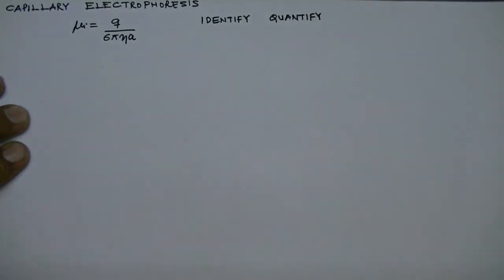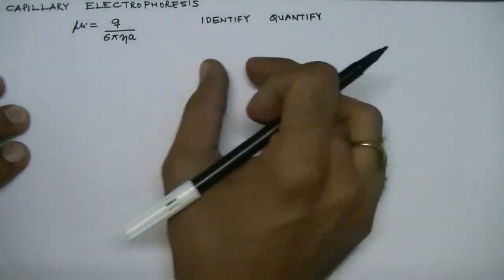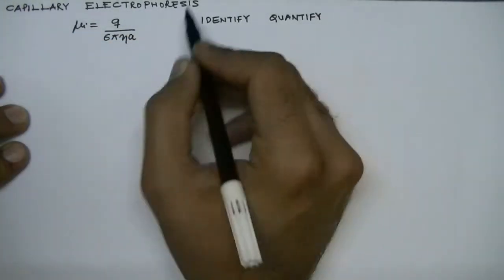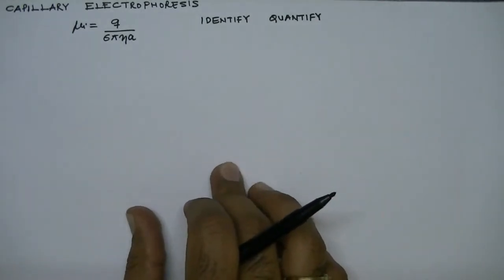Then the first step is that we should take that sample and separate it into distinct parts, the individual parts corresponding to individual ionic species, and then we can quantify what the concentration is in the original sample.